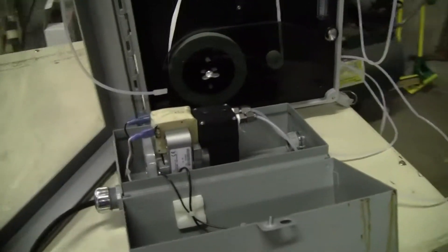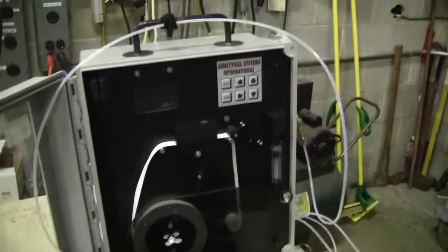Hi, this is Michael from HitechTrader. Today we're looking at an H2S sensor made by Analytical Systems International.